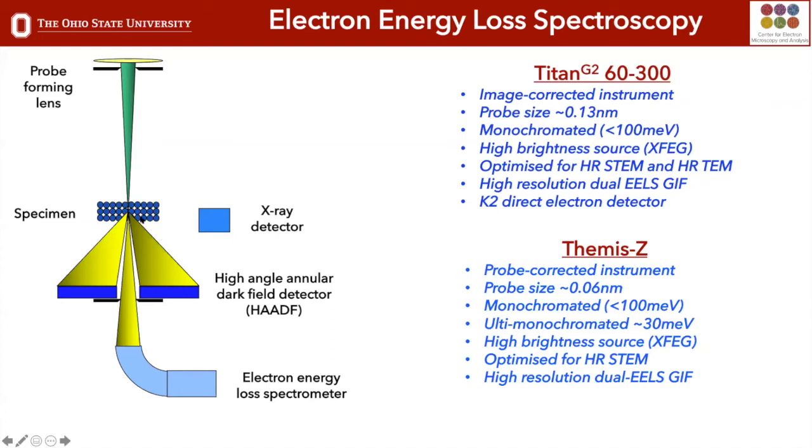And when they hit the sample, they can produce X-rays, right? And how does that happen? The electron hits an electronic shell or an electron and excites it to a higher electronic shell, and it decays, and out comes an X-ray. Well, that electron that we fired out of the gun had a certain energy, and it had put some of that energy into the sample to produce the X-ray.